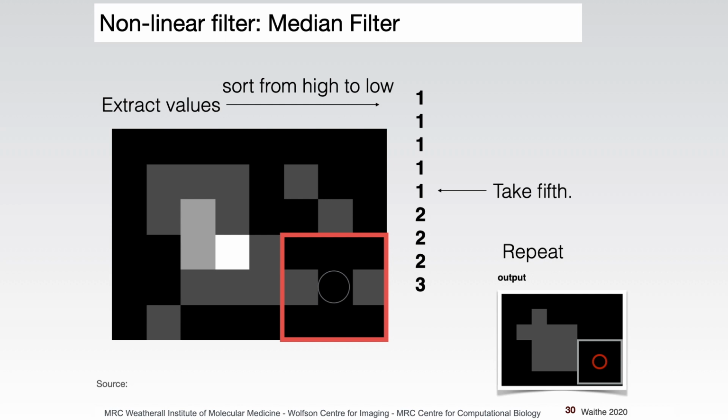It might still work though, because that's a small bit of corruption. And if you actually cropped out those few pixels, then you wouldn't lose anything. But I don't think it's a big deal. I think you could easily tile and then filter. I think that would be fine. And you could also filter before and then tile if you really wanted to make sure it was consistent. But yeah, generally it's such a small area, it's not such a big deal.